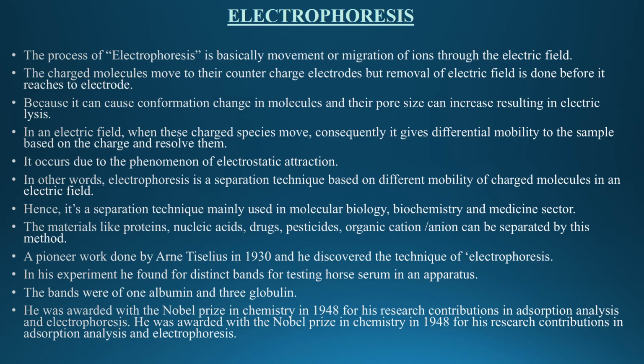The charged molecules move to their counter-charged electrodes, but the electric field is removed before they reach the electrode, because it can cause conformation change in molecules and their pore size can increase, resulting in electric lysis.